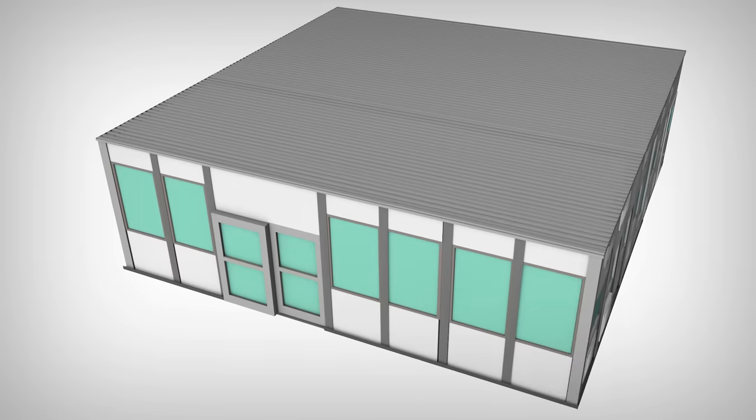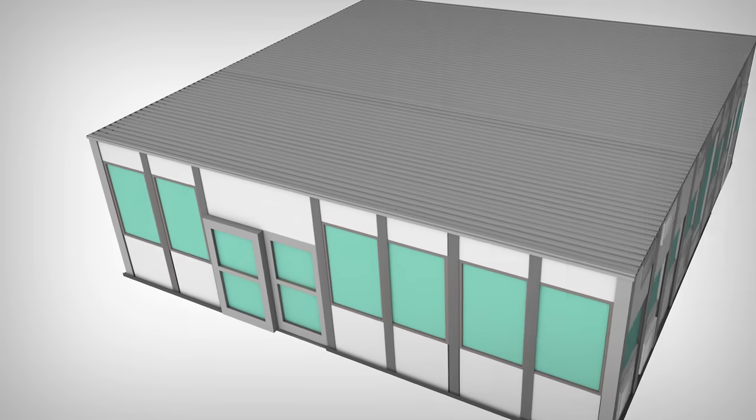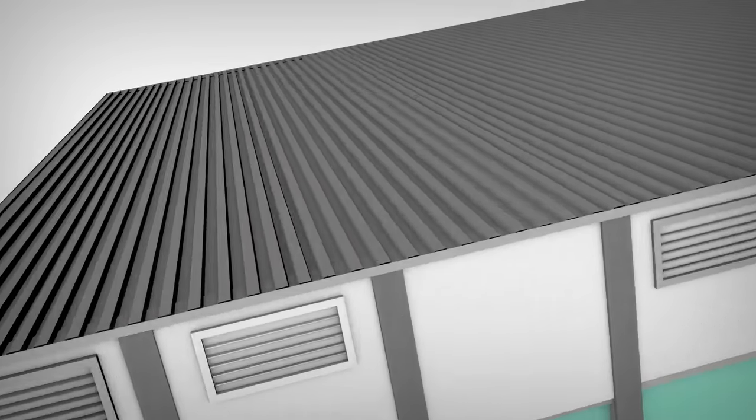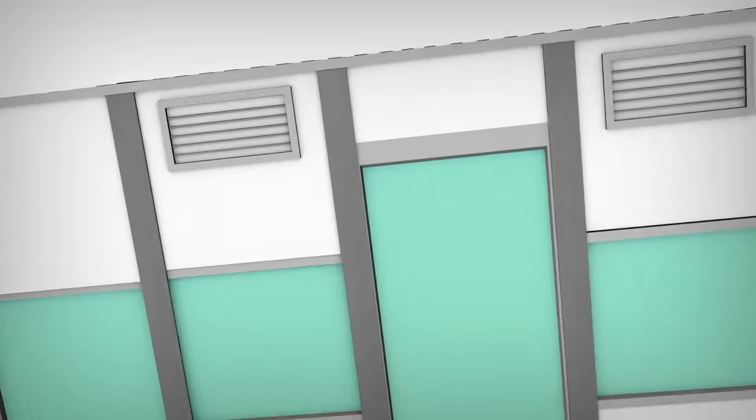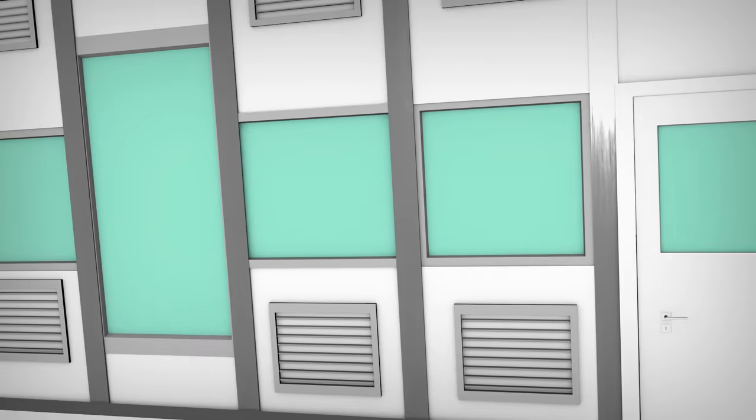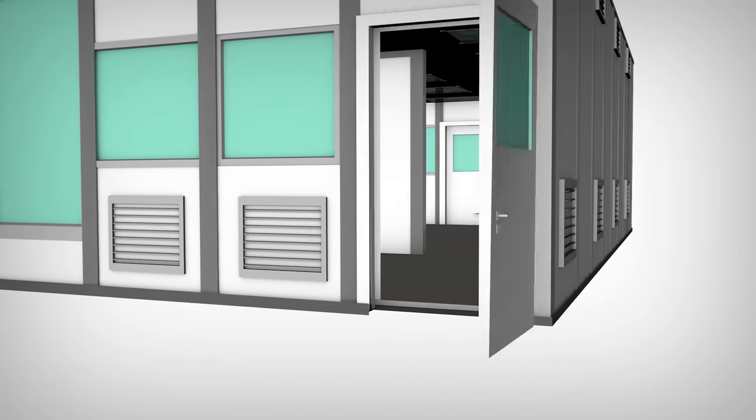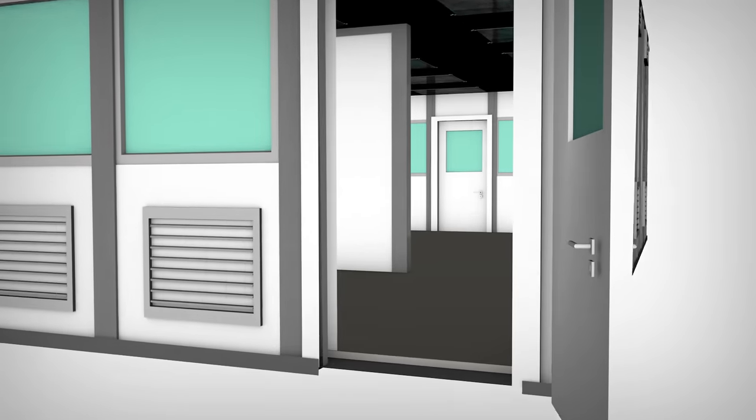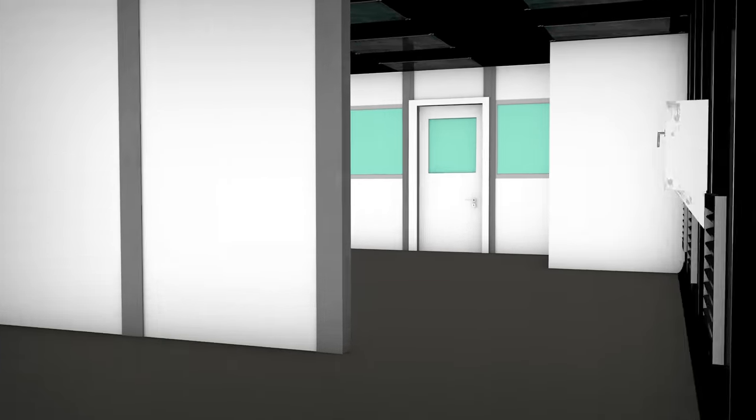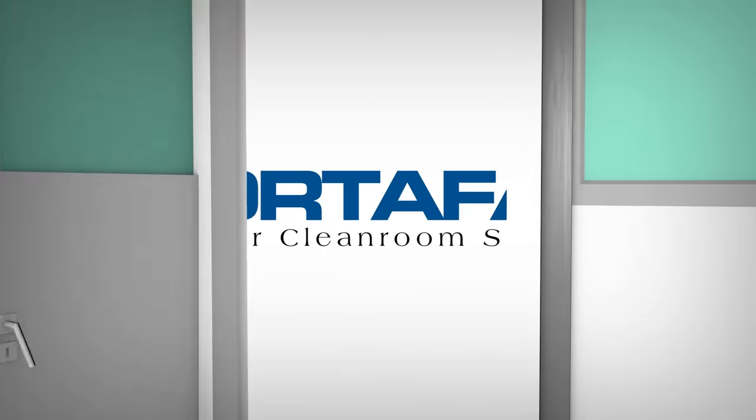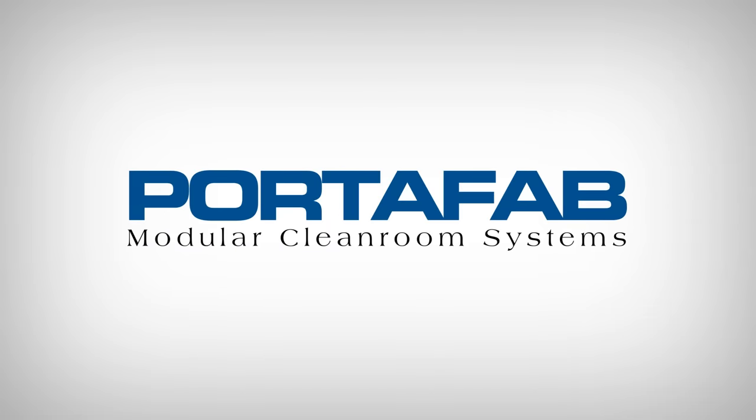Portafab's pre-engineered CleanLine wall system offers a simplified solution for cleanroom design and build applications. Less time to design, less cost to build, more flexibility. Portafab. Cleanroom construction simplified.